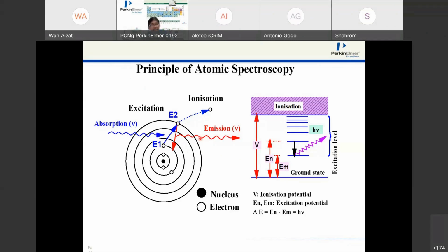In the ICP, we are using plasma. Plasma temperature is much higher. We are talking about 8 to 10,000 Kelvin, about 4 times higher than AAS. So electrons will be able to promote to higher orbital levels, become excited state. It's not stable. It emits excess energy as a photon. So for ICP-OES, no hollow cathode lamp is required. It's an emission technique. It can measure 73 elements, so it's up to the user which element you want to analyze. All wavelengths are available.